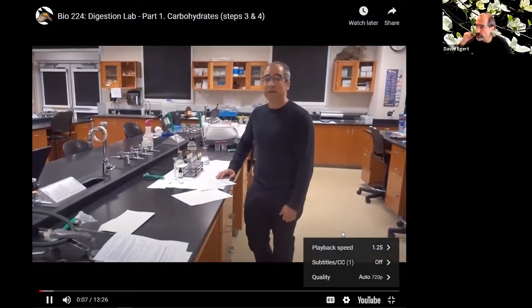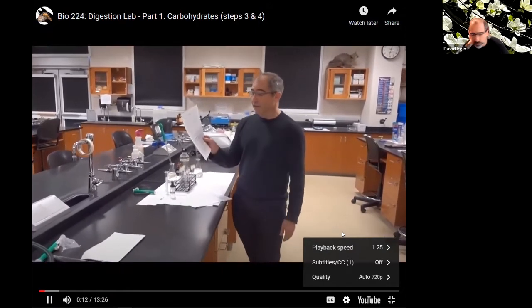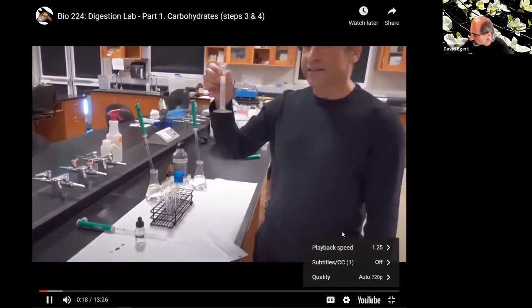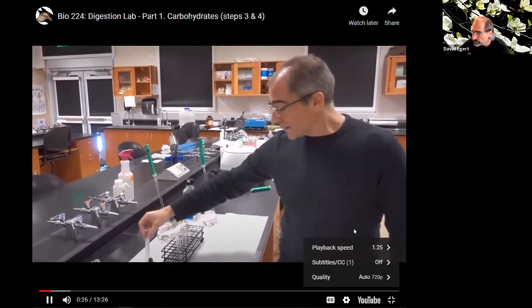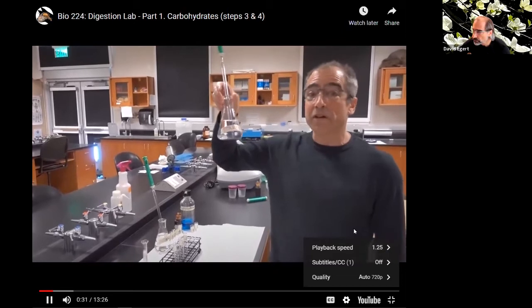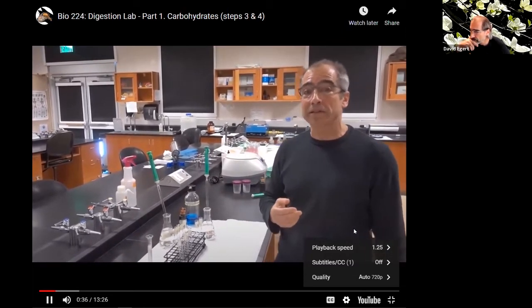All right, so now we're going to describe part one of the digestion lab, the salivary digestion of carbohydrates. We're going to be using this saliva that was generously provided by my lab mate, and this will be the enzyme. Then we've got our substrate for the enzyme, our starch here. And then we can look at how this process happens under different conditions.